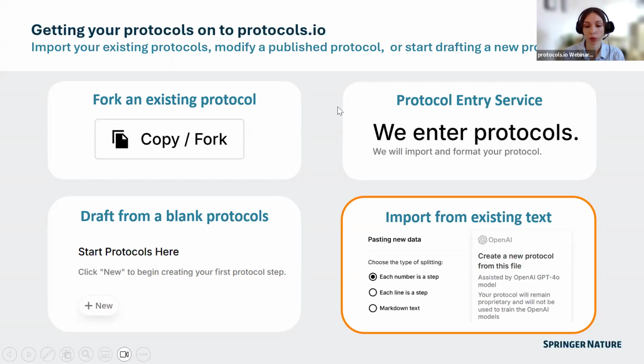Lastly, we also have this protocol entry service. This is a paid service where we have editors who will input that protocol for you. If you are part of an organization such as a university that has premium protocols.io, that is a complimentary service as part of premium. But if you are a free protocols.io user, the AI importer does work quite well if you wanted to get those protocols imported.